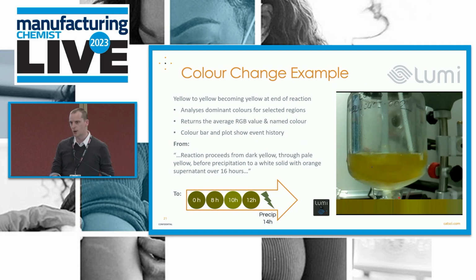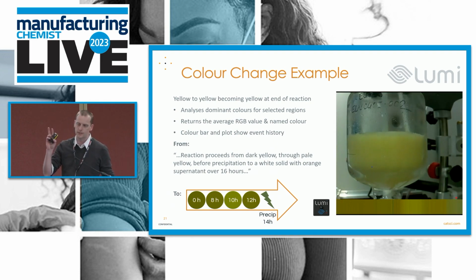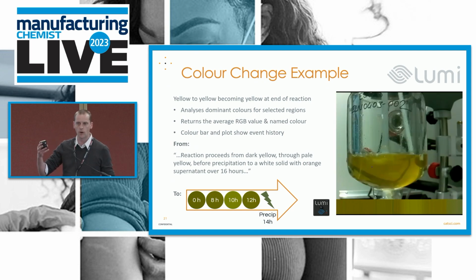They can take appropriate action to mitigate that. I was looking at the system last night as you're madly trying to finish bits of presentation, and I was looking at a reaction which was running, which we have got a link here, but I haven't got my computer. But as I was watching, the stirrer stuck, and so this was a suspension with a red solution and a white solid. But as I happened to be watching, obviously something has fallen off at the top, or with the stirrer, or stopped gripping. But then that would send a notification to the chemist. Unfortunately, it was at 10 o'clock at night, so they're unlikely to pop back into the lab to sort something out. But that's now logs exactly what happened during that reaction.